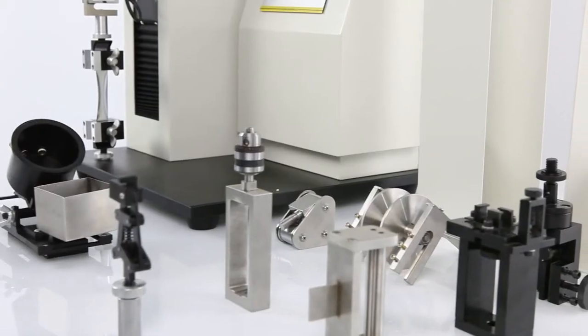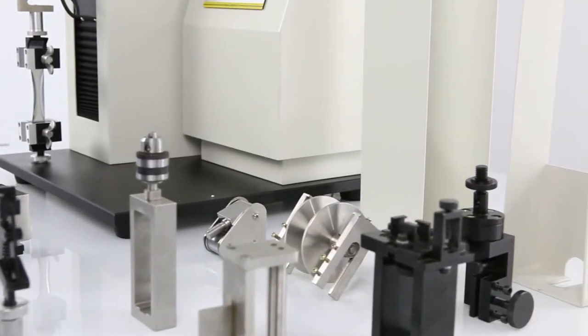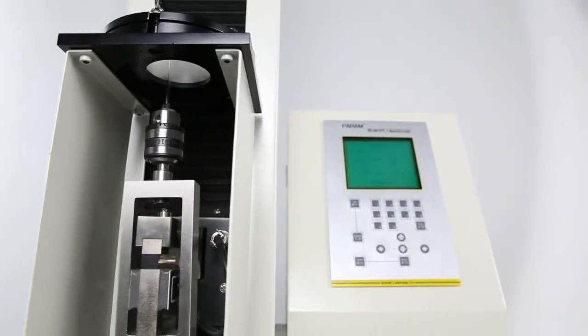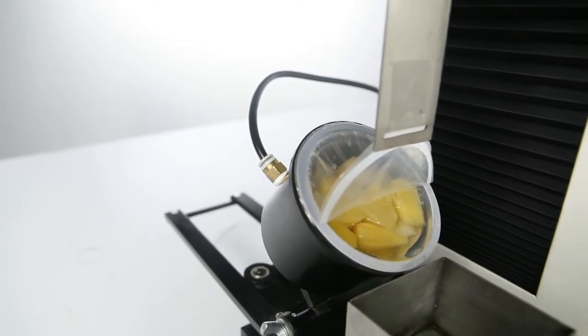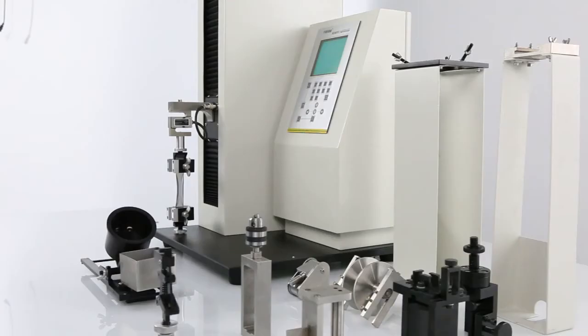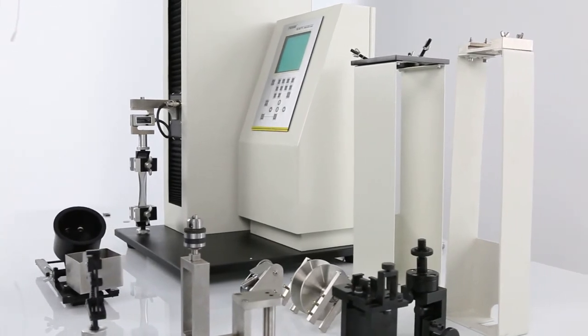With more customized testing fixtures, the tester can also perform a variety of other special tests, such as puncture resistance of artificial skin, opening force of jelly cups, peeling force of release paper and many more, becoming a multi-functional tensile tester.